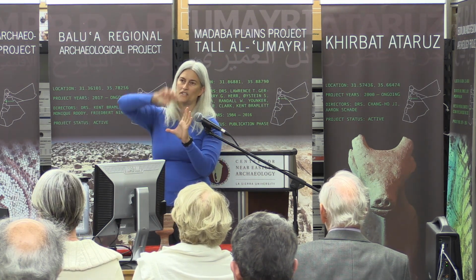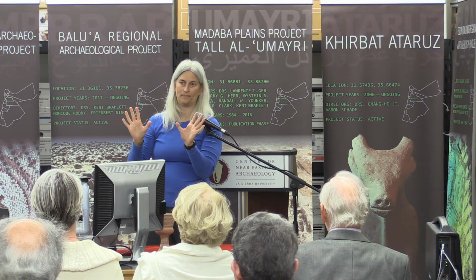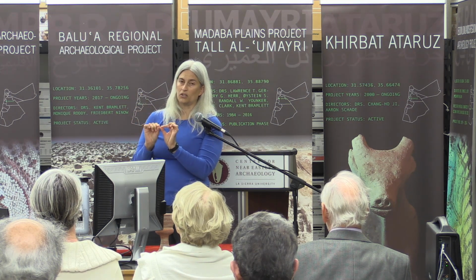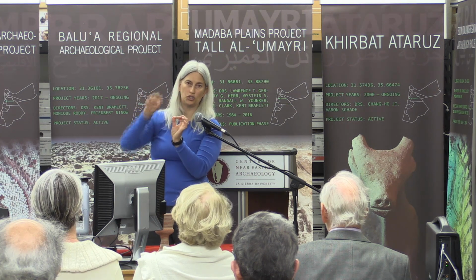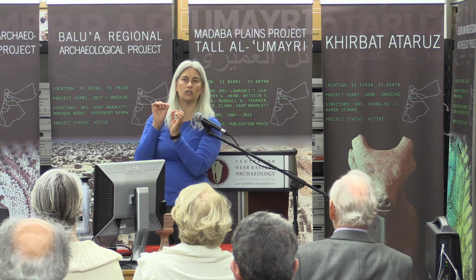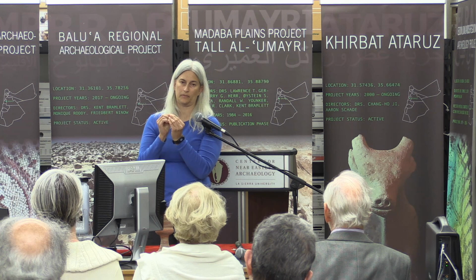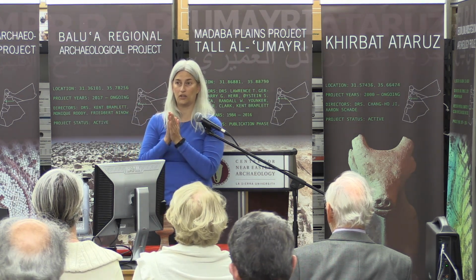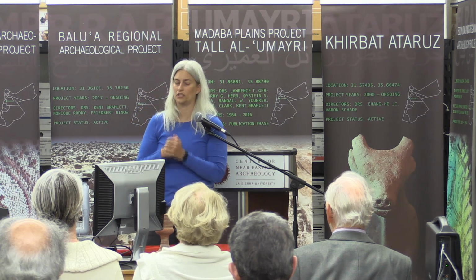The electrons are taking most of the volume of an atom, and they're on the outside. The electrons that we're going to first be talking about are our innermost electrons, the electrons furthest into our atom. Those actually need a lot of energy in order for us to interact with them. So we're going to do some X-ray fluorescence, and X-rays have very high energy. We're getting to that just in the middle part of our lecture.